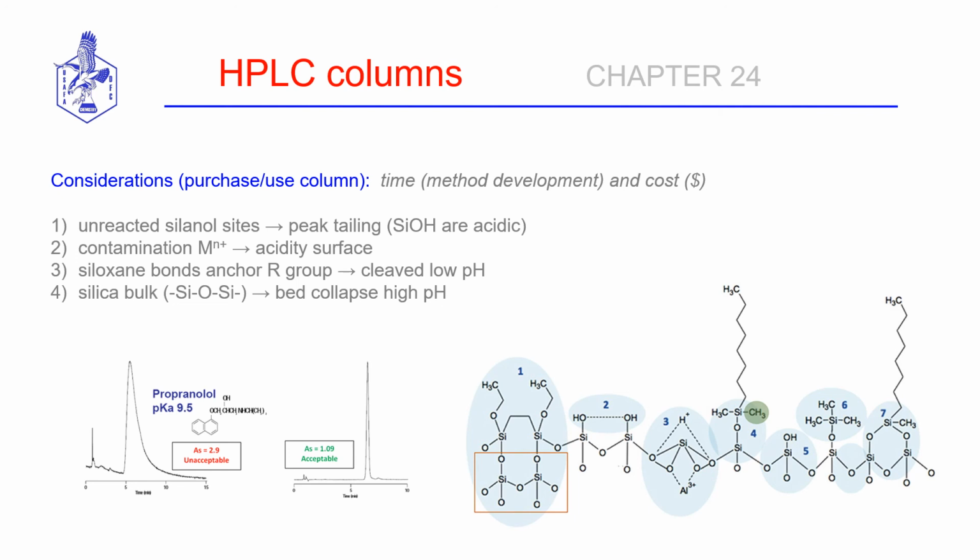The other perspective is time. It can take upwards of months to develop a method for a specific separation of a specific kind of sample. This is why research and development takes so long. This is why it's unrealistic for a variety of reasons to develop a COVID cure quickly. Just the analysis piece alone is going to take time.